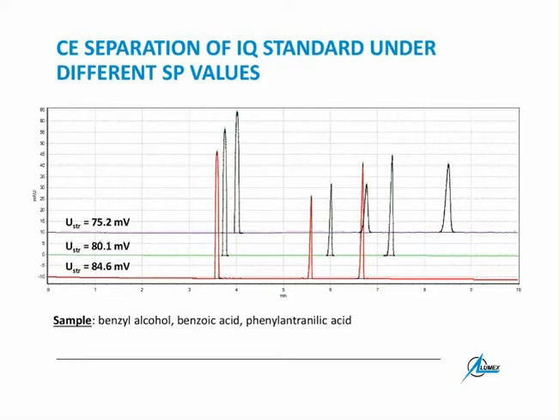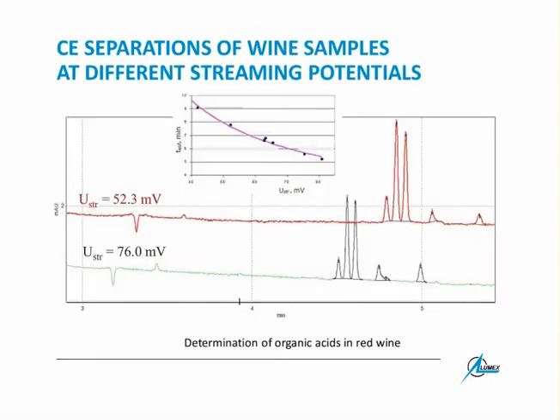And then we do not have such a mess, which you see on this slide, where we have 3 analyses and they are different, not slightly, I would say, they are significantly different in migration times. Yeah. So this is what we do with the migration time separations. Exactly on the same slide, you see that the upper trace is with a more contaminated capillary, and the bottom trace is with an absolutely clean capillary. And this is the reason why in the upper trace there was a shift towards the longer migration time.